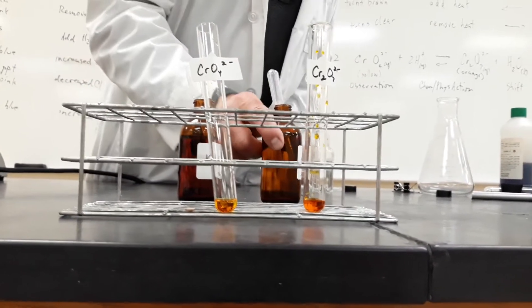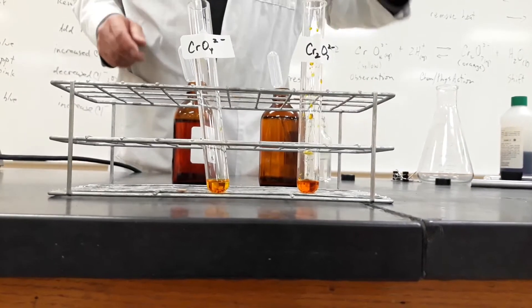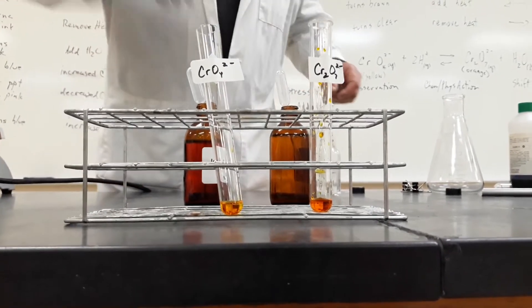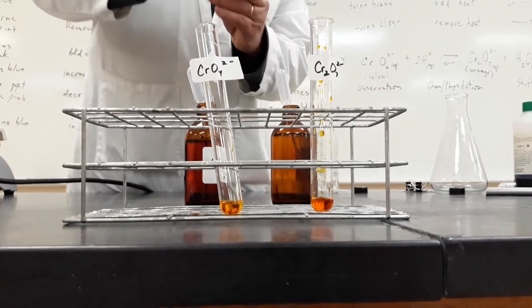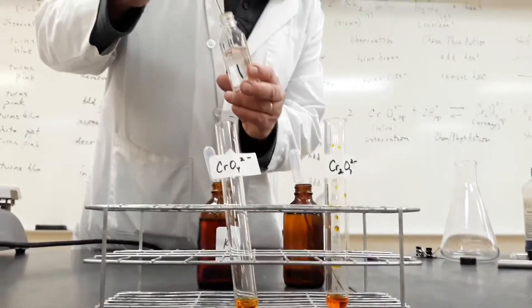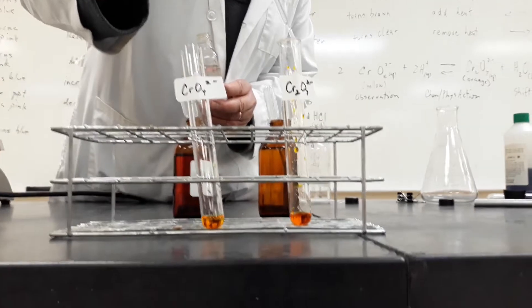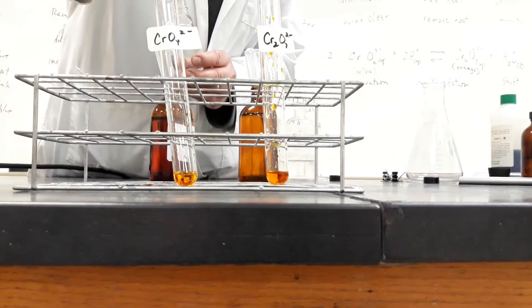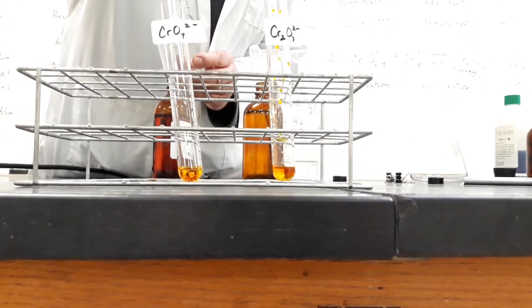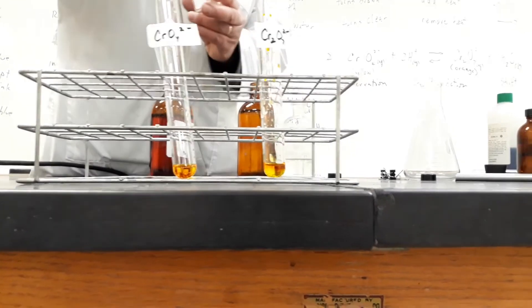Then we're going to add sodium hydroxide to the orange one, the dichromate solution. And we'll go drop by drop. And right away, we see it turns yellow.